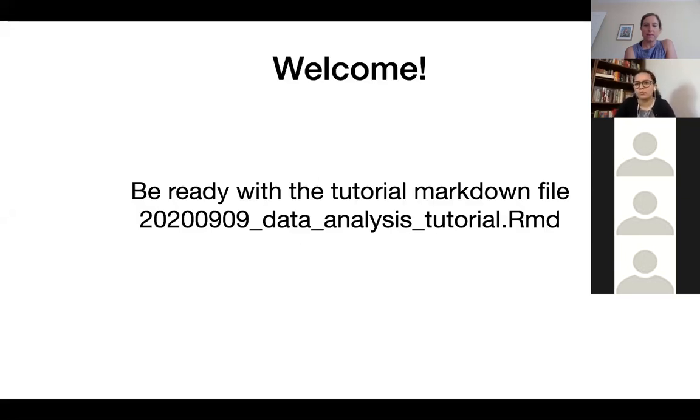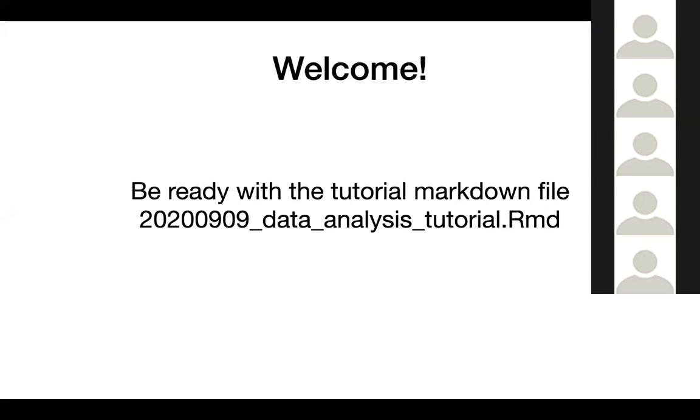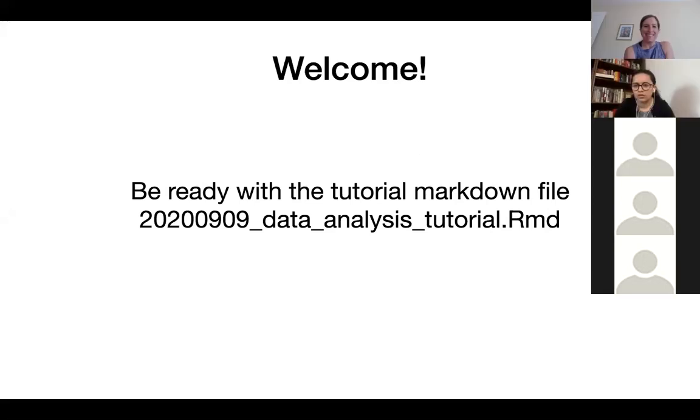I hope that all of you have the Markdown downloaded and ready, and all of your installations are done, our RStudio and the Markdown. It'll be very easy for you to follow along during the tutorial.